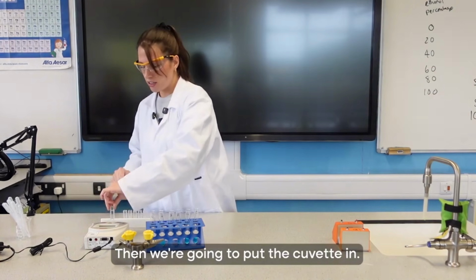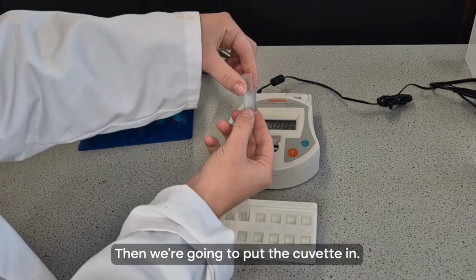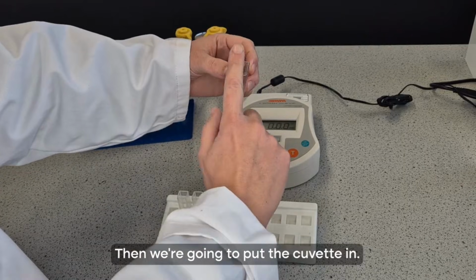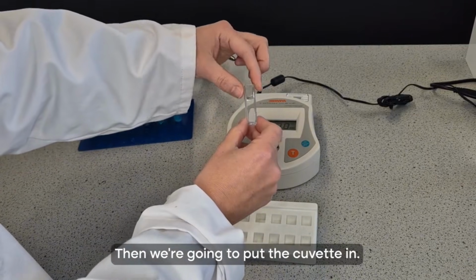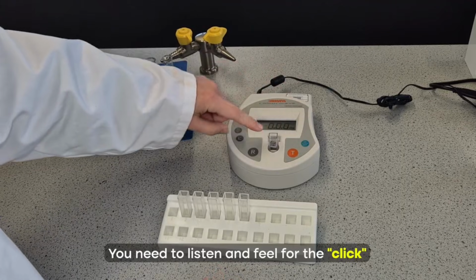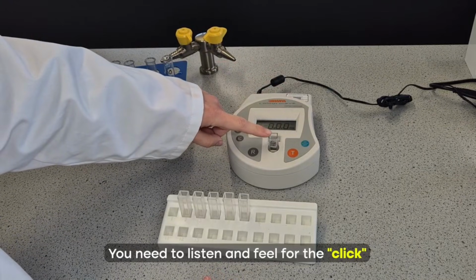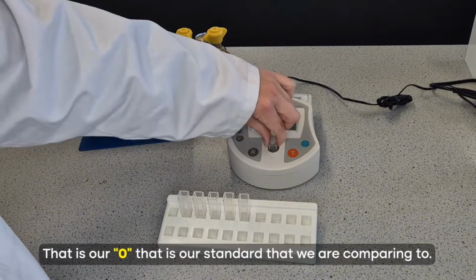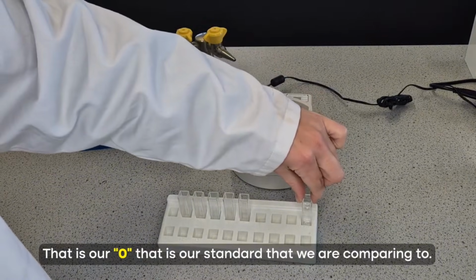So then I'm going to put my cuvettes in, making sure that I'm only handling it on the ridged side so I don't leave any grease and fingerprints on the front. And you've got the frosted triangle at the front. Students sometimes don't push it all the way in. You need to listen and feel for the click. And then press R to reset to say that is our 0. That is our standard that we are comparing to.